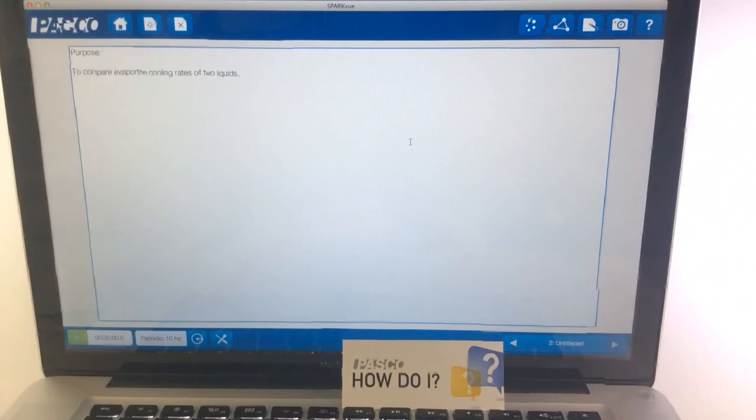And then I have my evaporative cooling journal which got saved to my desktop, and I can open up the HTML file which will have all of the snapshots.